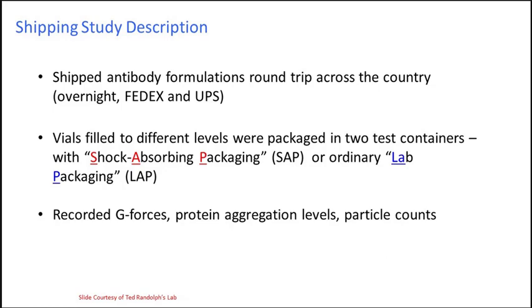The lab packaging was something that graduates didn't do. Imagine just duct taping a bunch of vials together in a package and sending it in USPS. But we didn't just do that. We prepared two different packages. Ted's lab prepared two different packages of the exact same IVIG material, but it was sent to North Carolina by FedEx and then came back to Colorado on UPS.